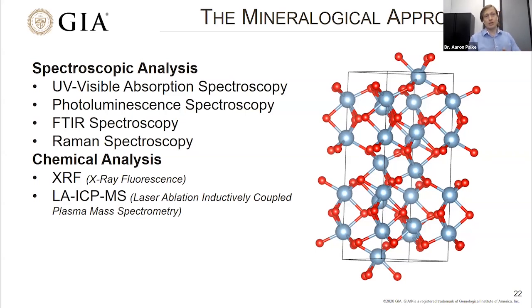And so some of the approaches, we can break this down into basically spectroscopic analysis and chemical analysis. I'm going to start with some of the spectroscopy, because the spectroscopy is really interesting. It's one thing that people know a little bit about in the trade, I think, but there's a lot of stuff that goes on behind the scenes that we'd like to share with you today.